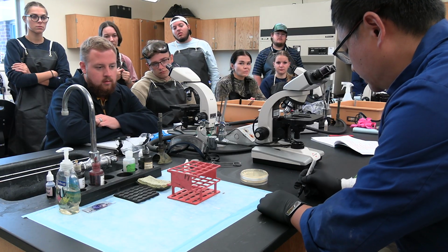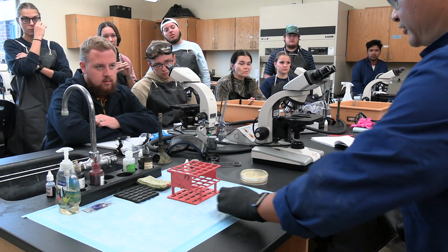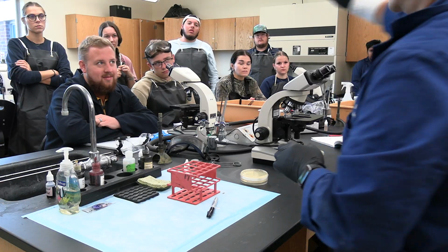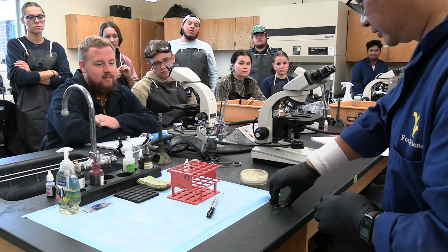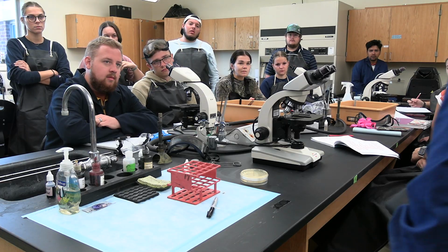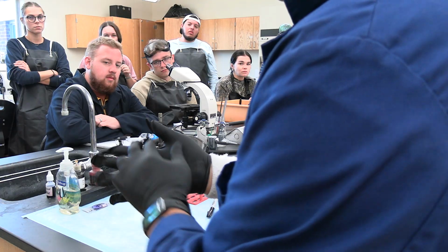One is labeled EC, another one is labeled EF, E. coli and E. faecalis. It looks like this. Then we flip it over. Now we're going to add the water there, the same thing like we did before.